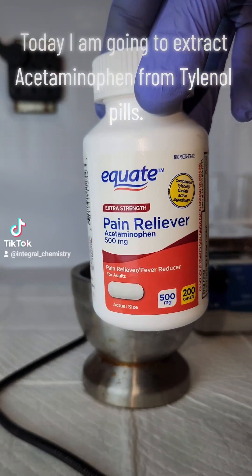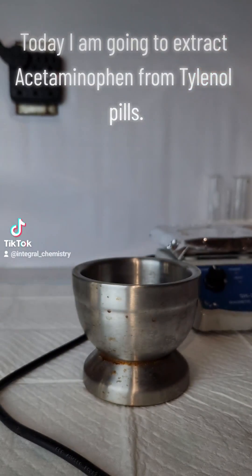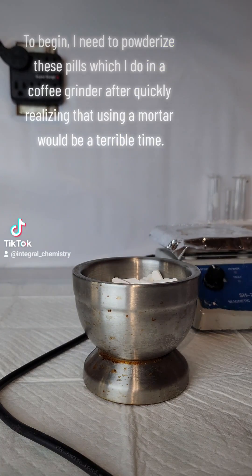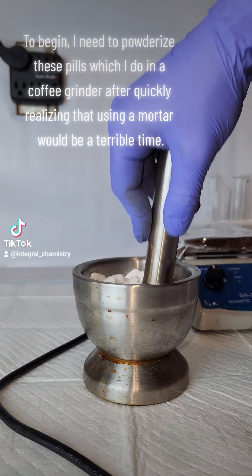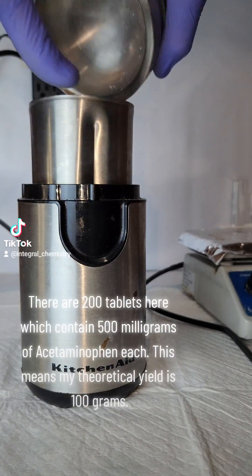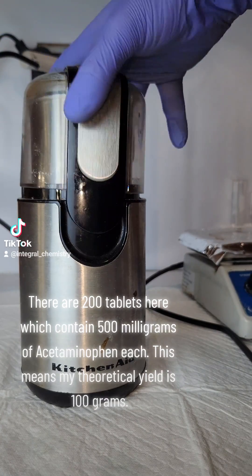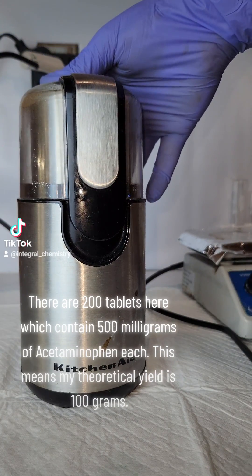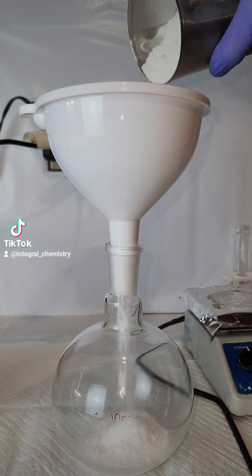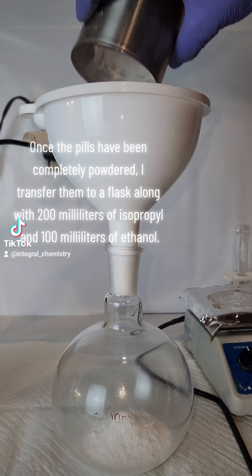Today I am going to extract acetaminophen from Tylenol pills. To begin, I need to powderize these pills, which I do in a coffee grinder after quickly realizing that using a mortar would be a terrible time. There are 200 tablets here which contain 500 mg of acetaminophen each, meaning my theoretical yield is 100 grams.